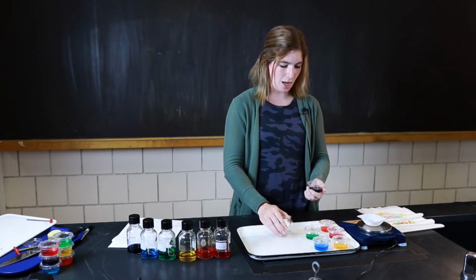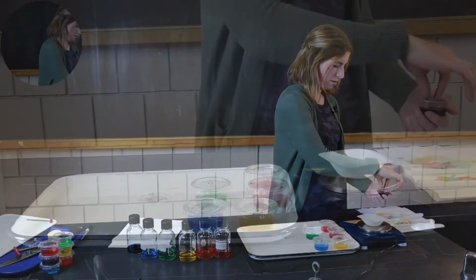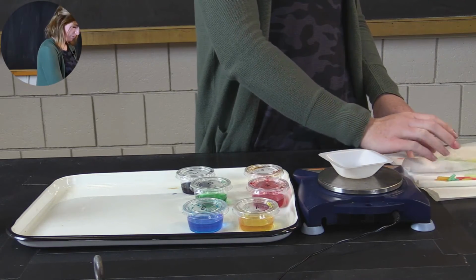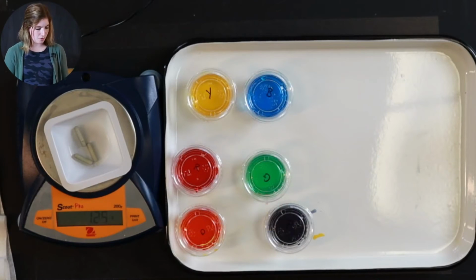And finally, we have our purple ones. Their final mass is 1.37 grams.